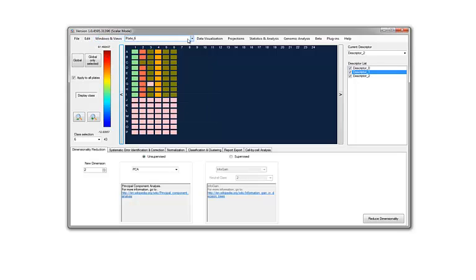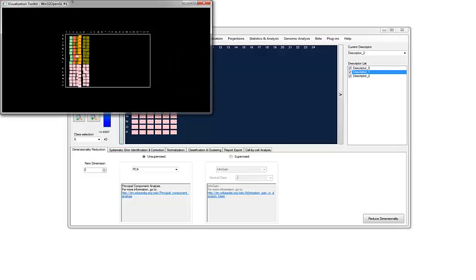You also have access to many different kinds of view options using this toolbar, especially the different kinds of views that we will describe later. I just want to come back perhaps to this one, which is a 3D visualization. It means that you can also take a look at the display from a 3D point of view.